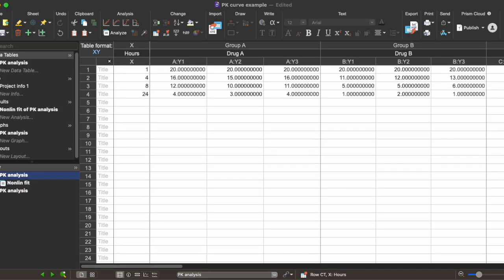Here we're assuming that the two drugs were injected at the same dose such that the bioavailability of each drug is supposedly about 100% at hour one. So just hypothetically, we have a value of 20 for our drug concentration in all of our replicates.